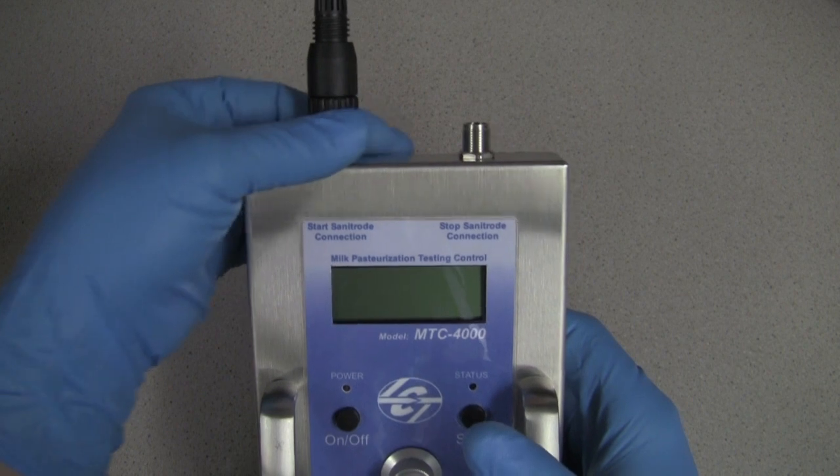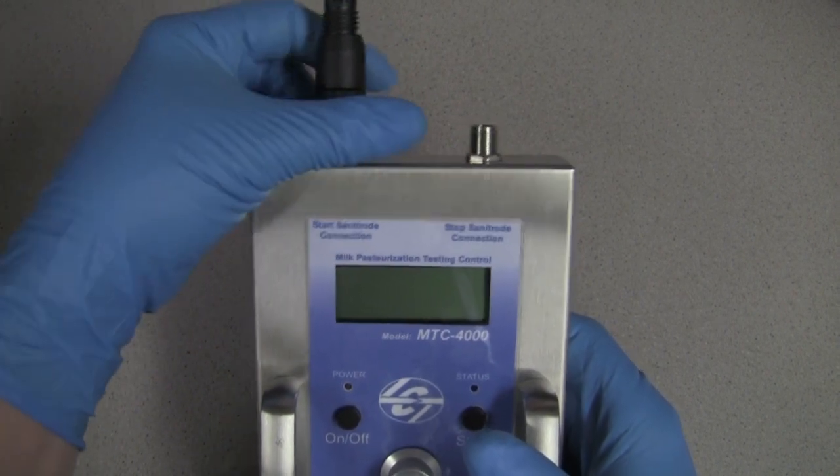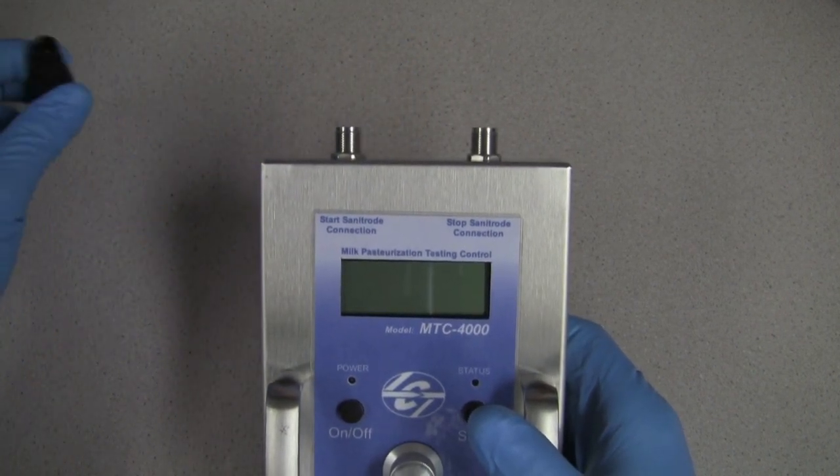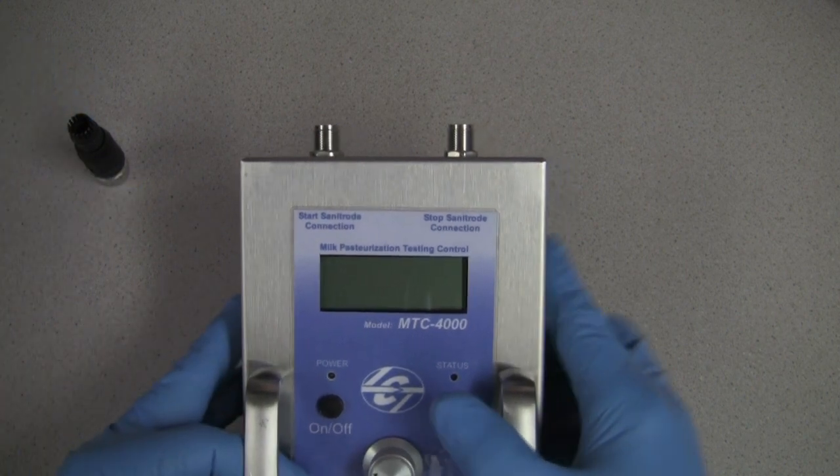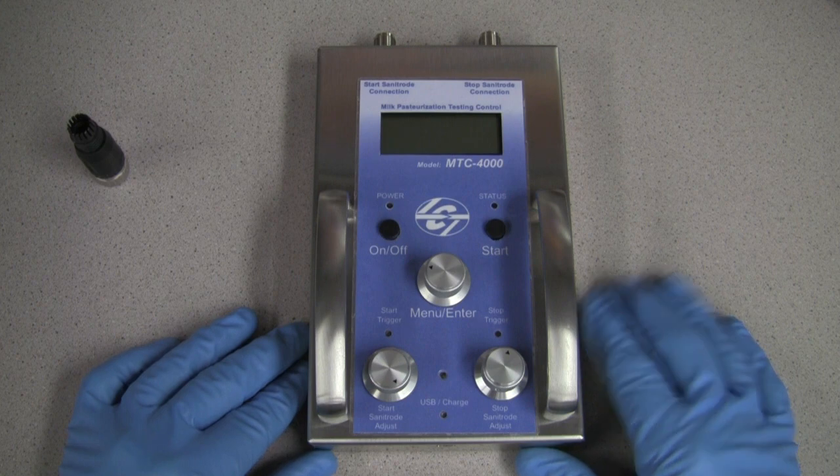FYI, be careful not to tighten the jack connector into the MTC4000 using the black plastic part of the connector. The outer stainless steel ring is the only part of the connector that rotates. Rotating the black portion of the connector will lead to twisted, broken pins.